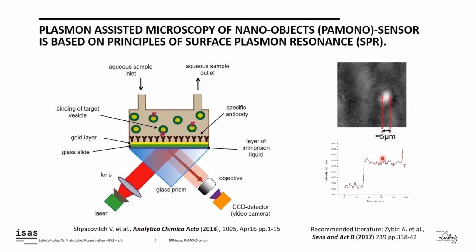Over here, you may see also the so-called step signal. This graph represents changes of intensity during the measurement time. First, intensity oscillates at a particular level. Then, a binding event occurs. Intensity jumps and stays on the new level, oscillating on it, as you may notice on the graph.